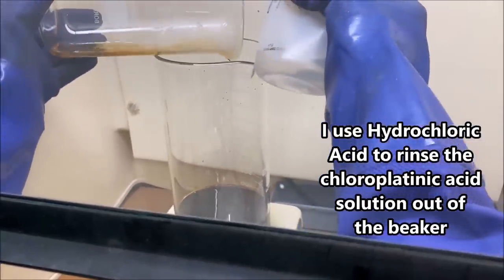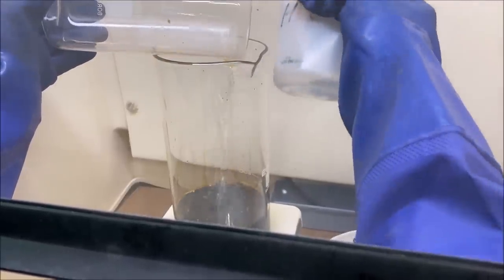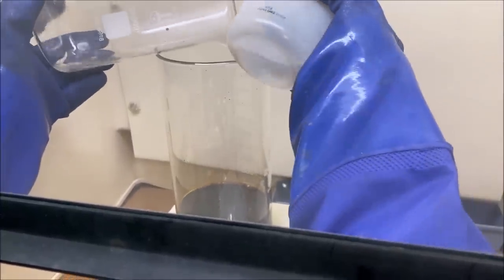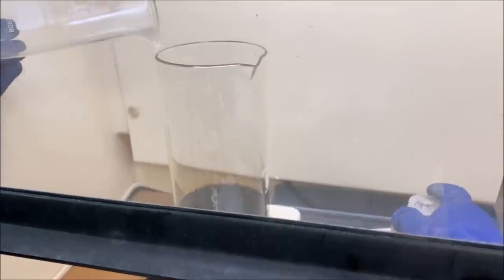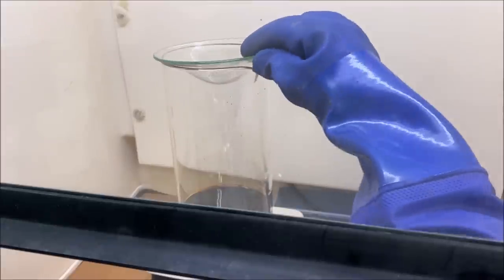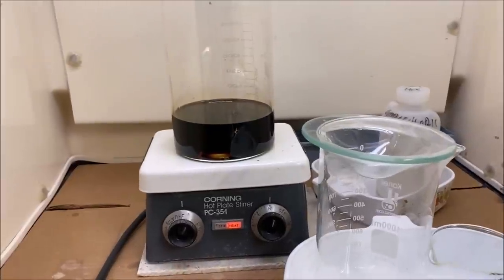And here, if you look in a minute when I pour this off, you'll see some of it splash up, a little brown dot on the beaker in my left hand there. There it is right there, that little brown dot. That is a splash of the platinum chloroplatinic acid there that splashed up and hit the beaker. That's why I got these protective gloves on to prevent any of that stuff from getting on my skin. It's highly toxic, very nasty stuff. You just cannot get any on your skin or it creates platinosis, which is a disease of the skin that never goes away.